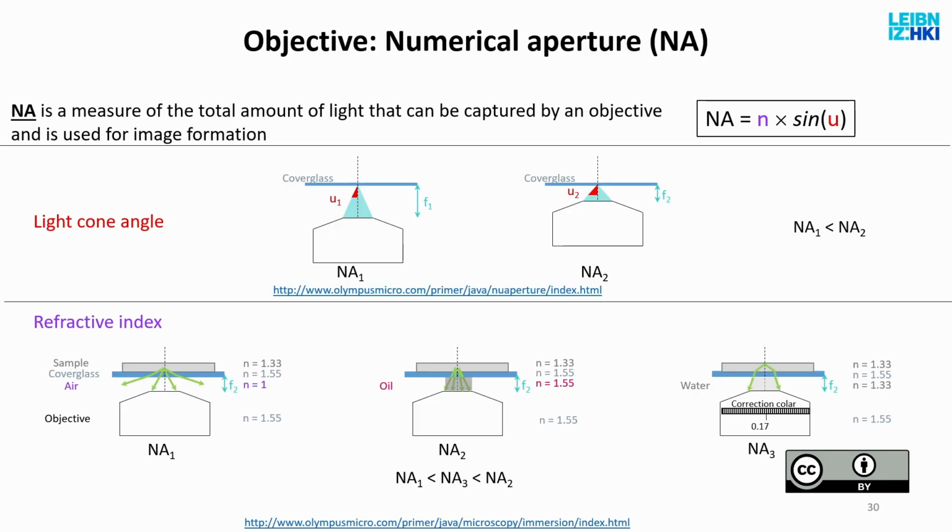So now if somebody says, okay, I would really like to see my individual mitochondria, I have a choice between a 63x or 40x, what we call an air objective, where there is nothing in between the sample and the lens, a 40x oil and a 40x water. And I'm looking at small objects, submicron objects. Now you know which one to choose. You will not go, oh, I want the air one because then I don't need to use oil. Oil is messy, yes, and you have to clean the objective lens carefully in between experiments. But you gain a factor of 50% in terms of resolution.